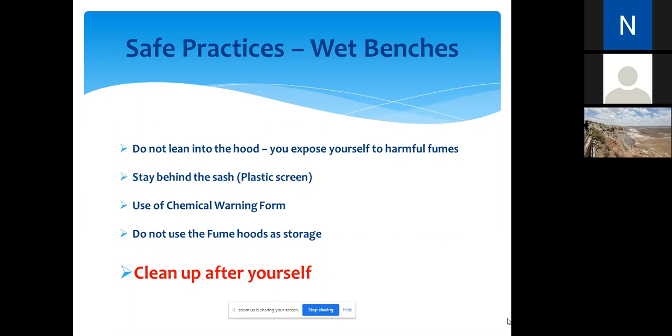And if you're going to be using vessels, beakers, and all that, always make sure you clean it. Even though you picked it up from the dry rack, you don't know if the last person cleaned it or not. You'd never assume that, well, it was on the rack and therefore it's clean. There are some of us who are very lazy. So you need to be aware.